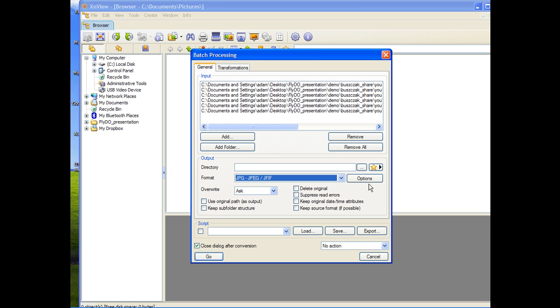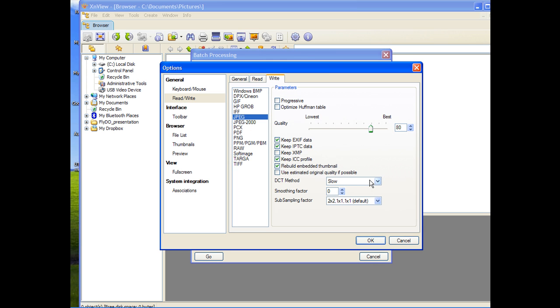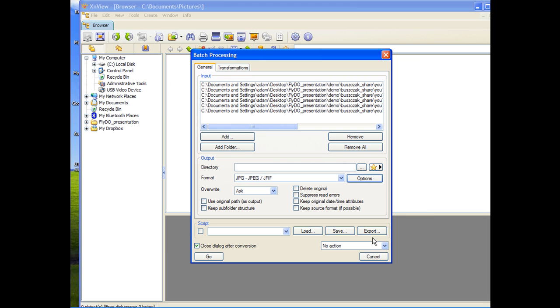The other important point here is, like I said, TIFF has a much higher resolution than JPEG, and so you want to make sure you go into your options and just turn up the quality as high as you can go. So put it up at best. I don't know what most of these things mean. Progressive sounds good, right? Probably. Float, best but slowest, etc. Best quality, and run it that way.